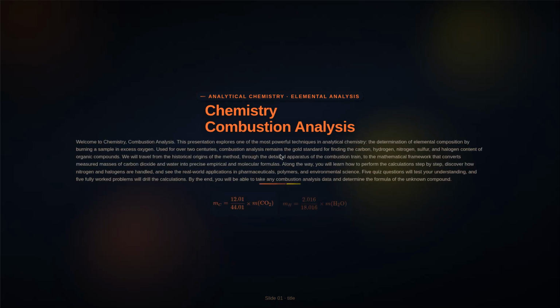Welcome to Chemistry Combustion Analysis. This presentation explores one of the most powerful techniques in analytical chemistry, the determination of elemental composition by burning a sample in excess oxygen. Used for over 2 centuries, combustion analysis remains the gold standard for finding the carbon, hydrogen, nitrogen, sulfur, and halogen content of organic compounds.